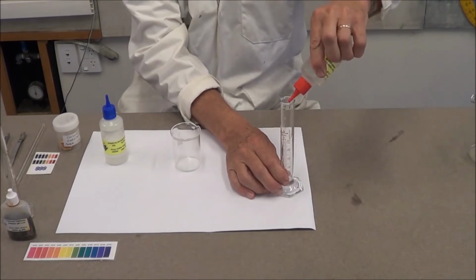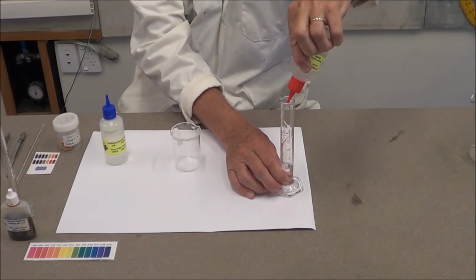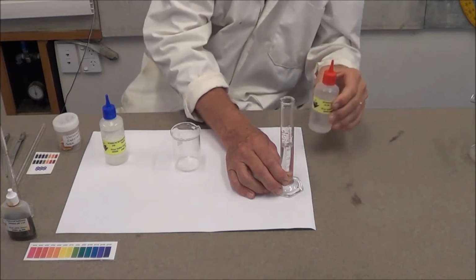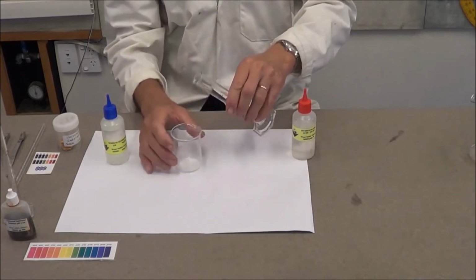First, measure 20 ml of 2 moles per litre hydrochloric acid, ensuring that the meniscus is sitting on the 20 ml mark, and pour this into your beaker.